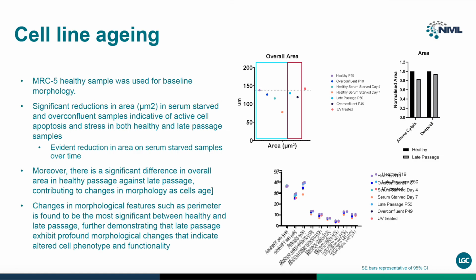And independent of this, what we wanted to also show was that we were able to see the same trends with DeepCell within our previous analysis as well, using the attune cytometer, with the reduction of the area that we see here with MRC5, adherent cells that have become suspension cells.